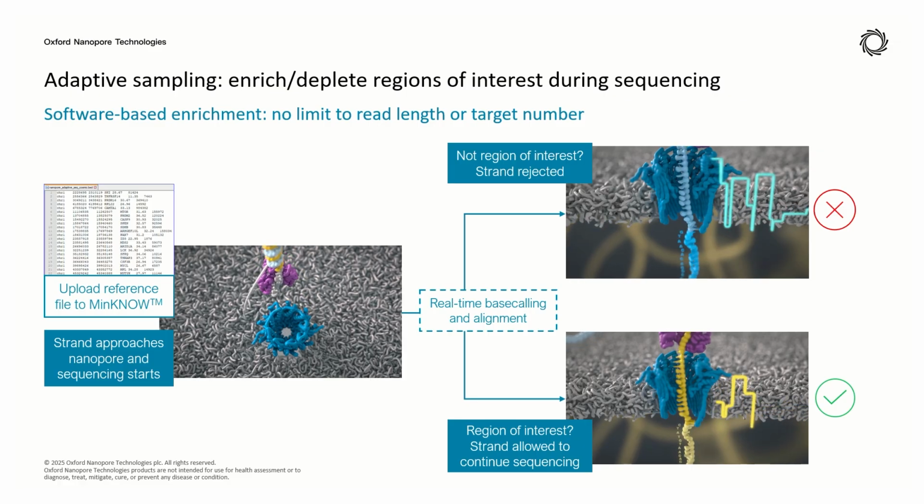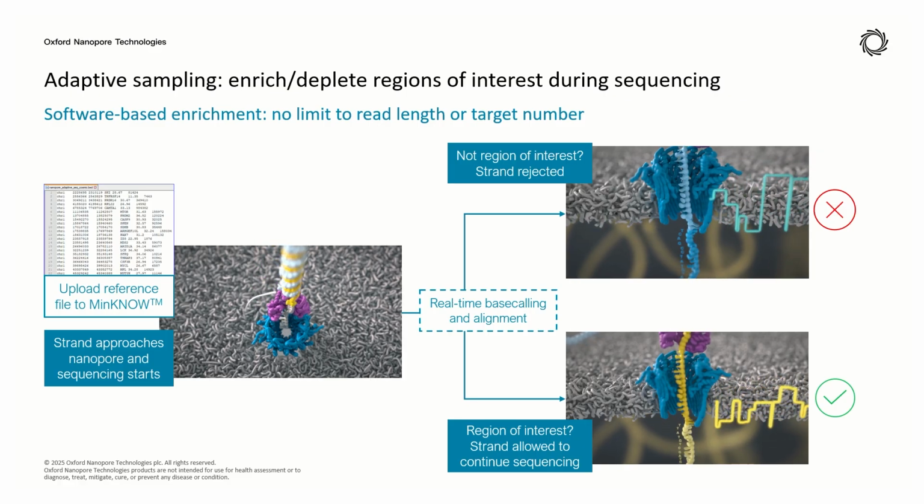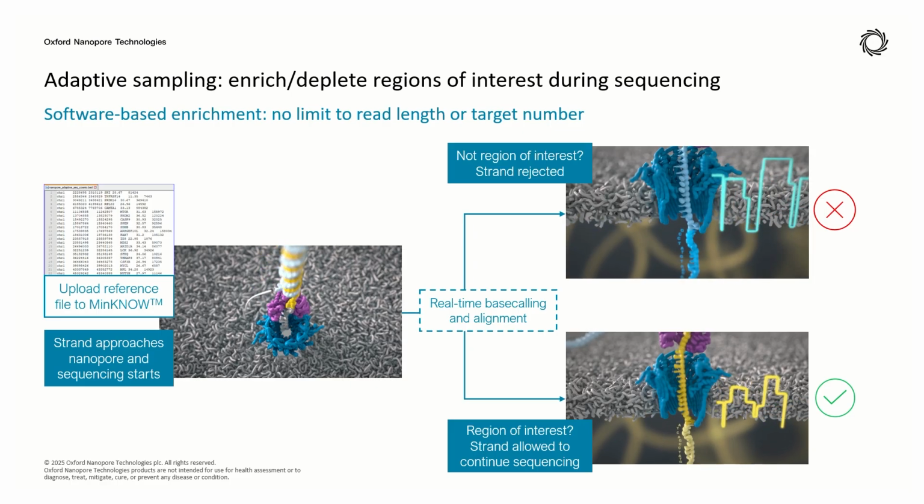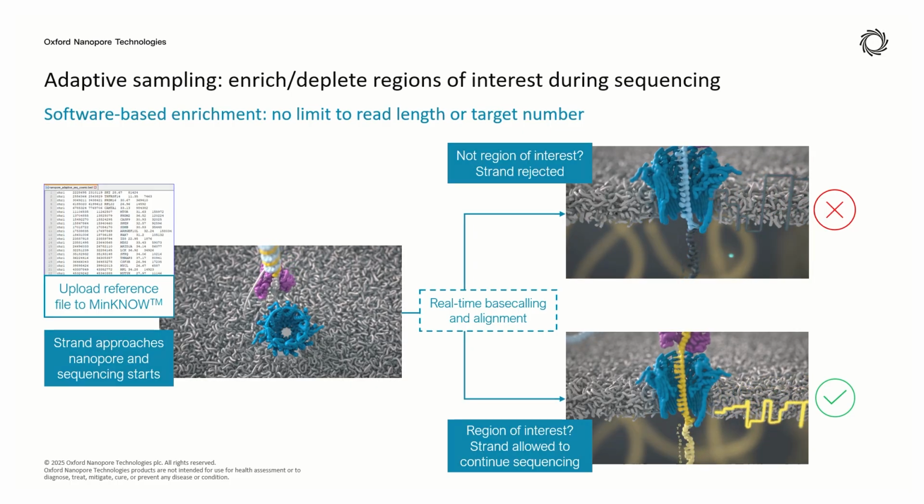With this, because it's alignment and the technology is fundamentally the same, it means that we can just pull up the new targets file, run adaptive sampling, and the expectations will be the same. So again, the technology itself fundamentally supports the idea of stability within certain contexts, of course.